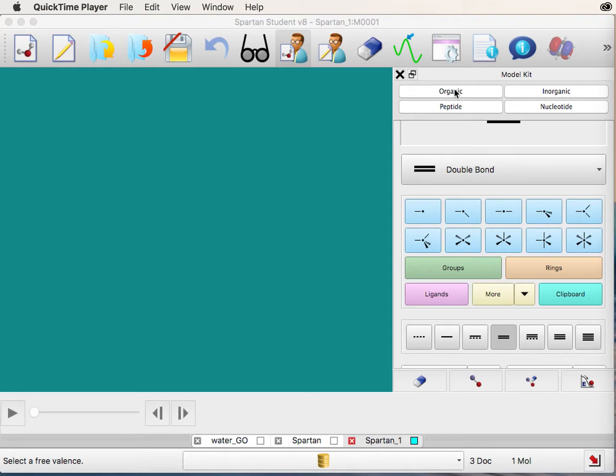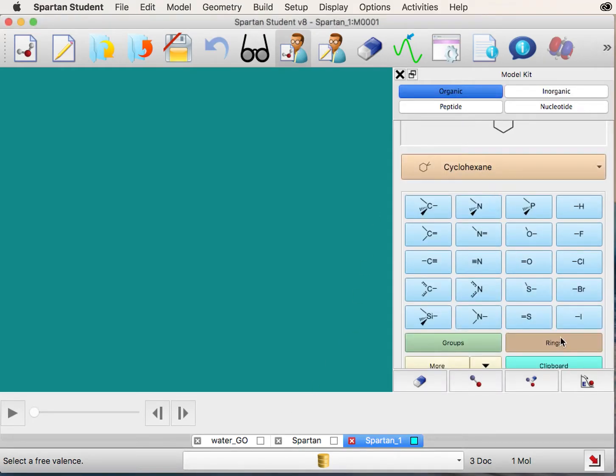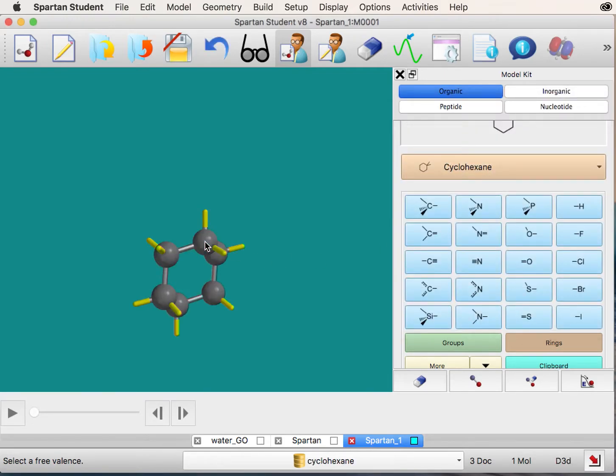In your model kit, ensure that organic is selected. First select rings and choose cyclohexane from the drop-down menu and double-click to add.